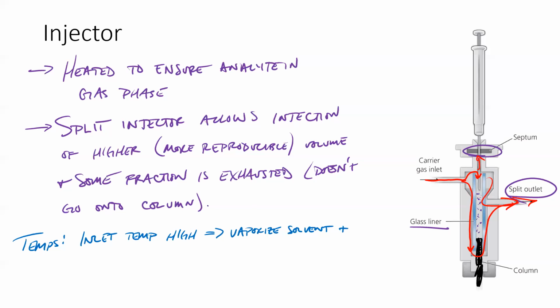Because that pan's not at exactly 100 degrees, the boiling point, it's pretty much well above that. And so this inlet temperature is not 105 degrees so the water just boils. It's well above that, so that the solvent, water, or whatever it is, pretty much vaporizes instantaneously.